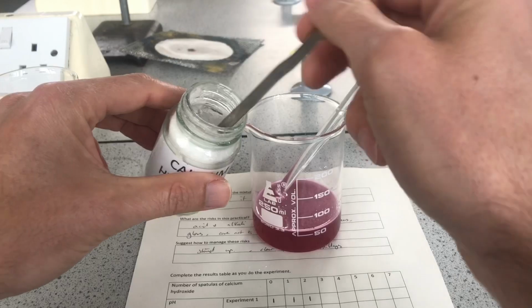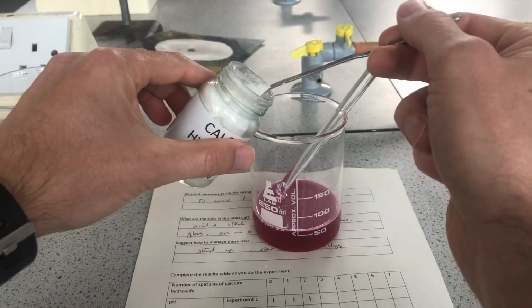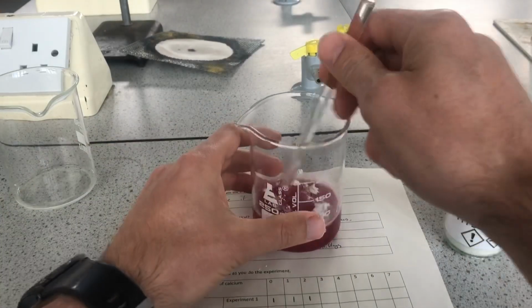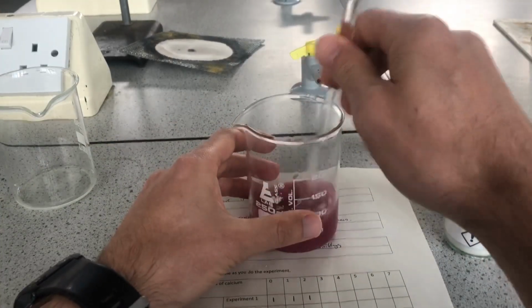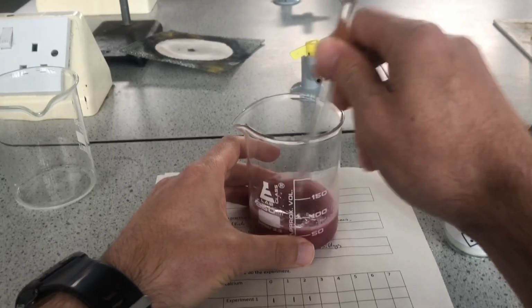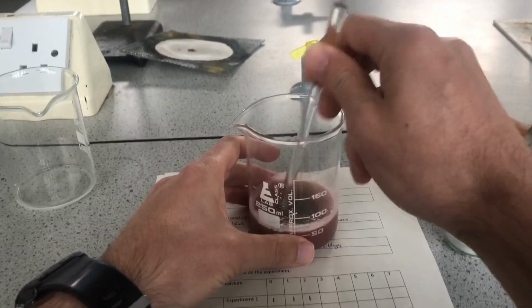Now, a lot of PhD students will try and imagine a change in colour because that's what they were expecting. It's called confirmational bias. You've got to be careful in science not to see what you think you might see.